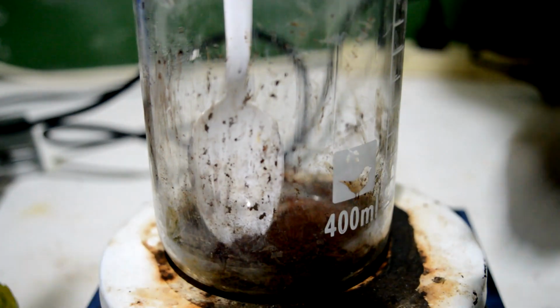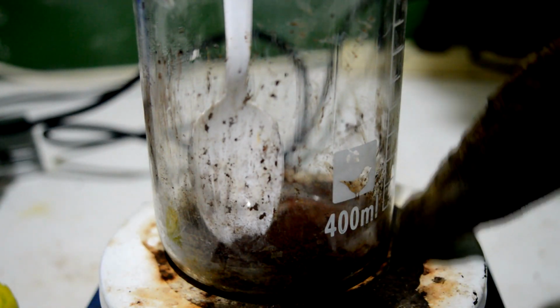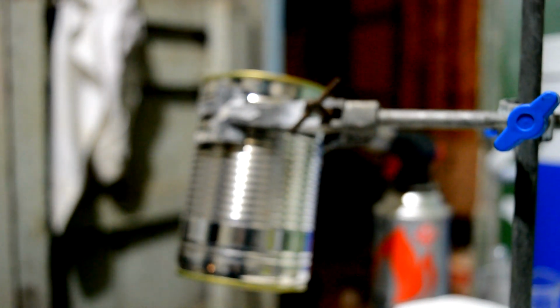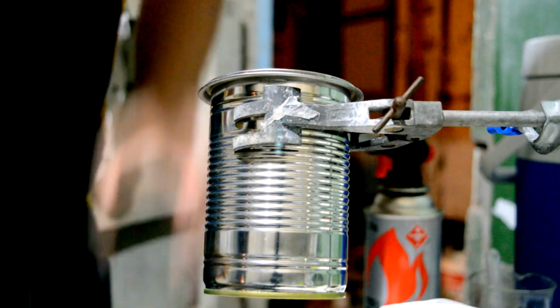Dried pretty well. And now the next step is we want to decompose it to the copper chromite, and we need to do that at like 400 degrees or so. So we're going to go over here. Where is it? There. We have a soup can. I think it makes a pretty reasonable crucible.